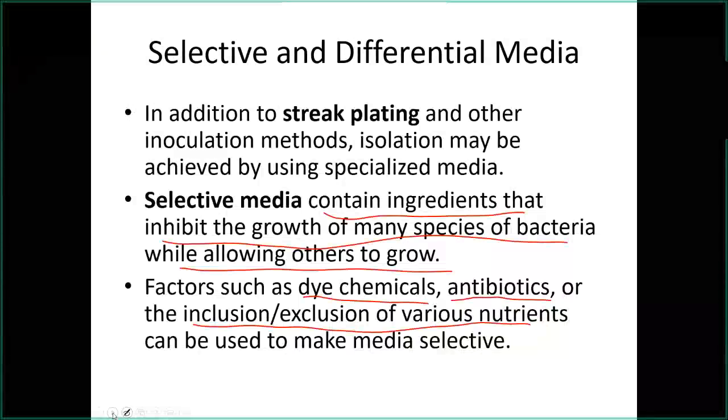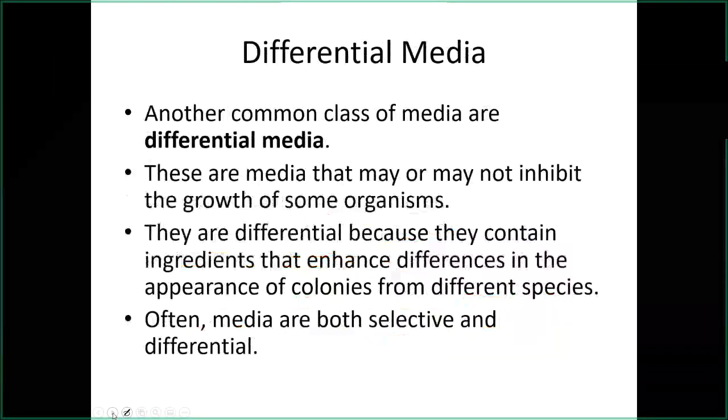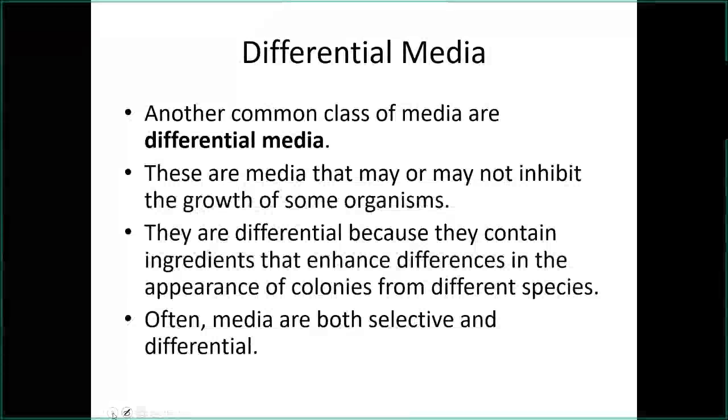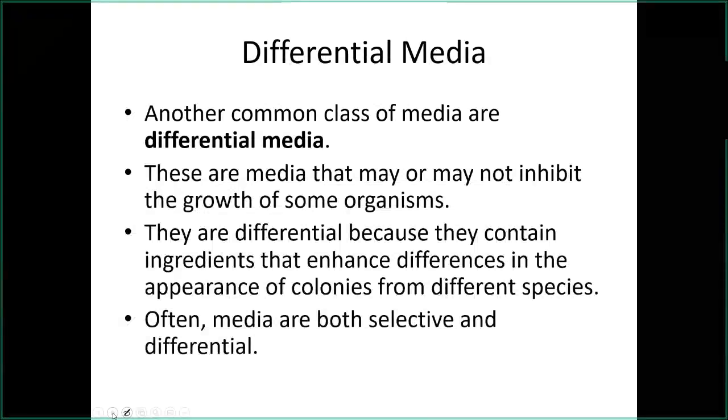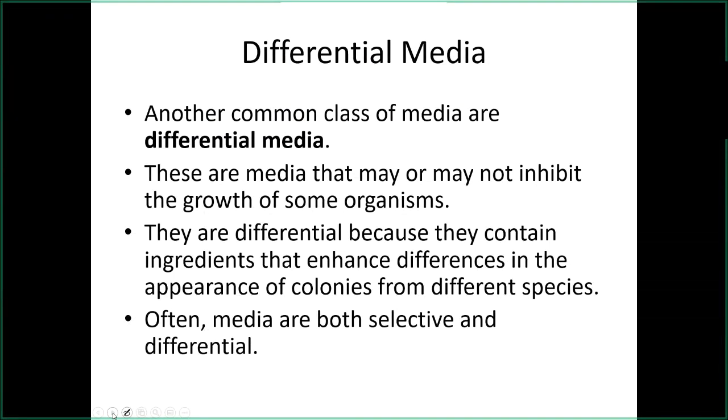That's the whole goal. Of course, now we also have differential media. If you have a medium that is strictly differential, it's not going to reduce the number of organisms that you have in a mixed culture. But what it will do instead is highlight the differences between them. I know we've talked about this before. This is kind of a lecture thing, but it bears repeating, and it is something that we deal with in the second half of the lab.